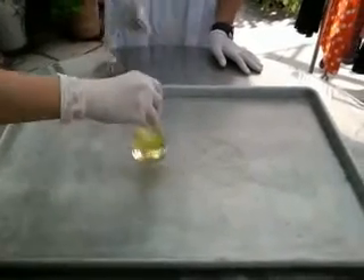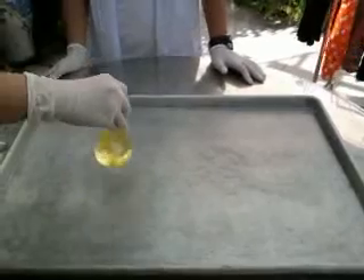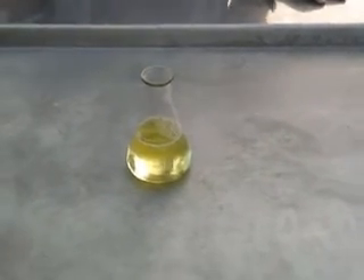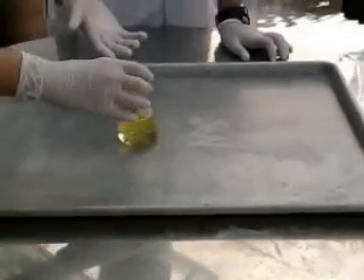Ok, we will shake the mixture to be mixed. After that, we will pour the potassium iodine solution into the detergent.